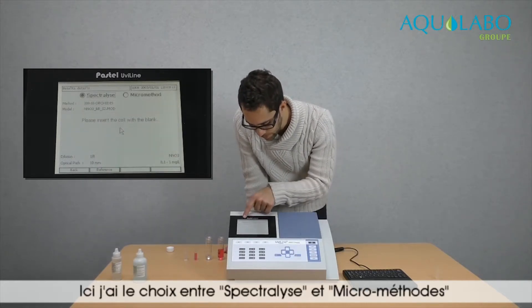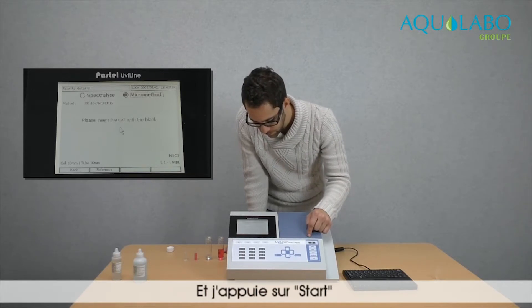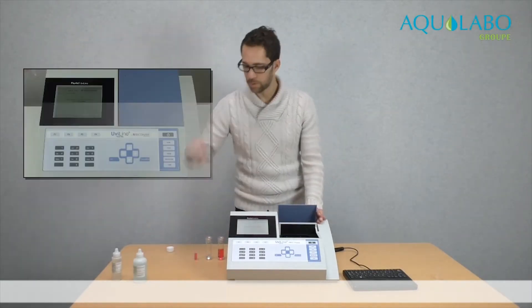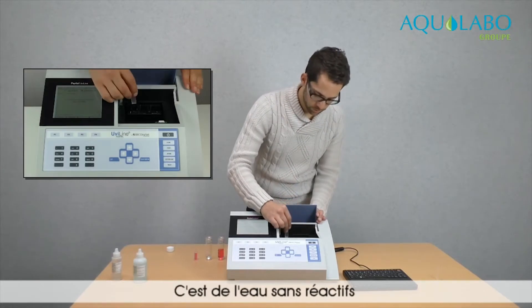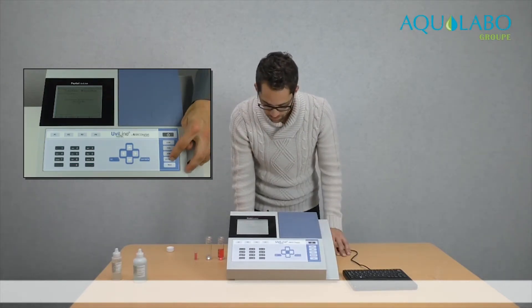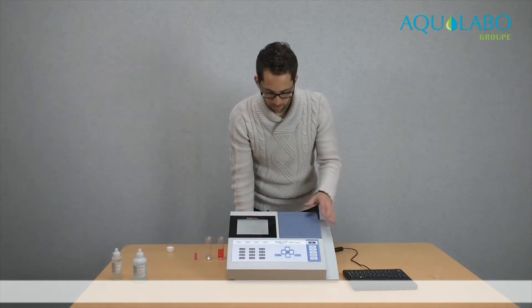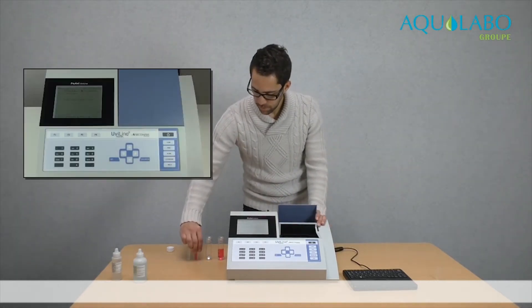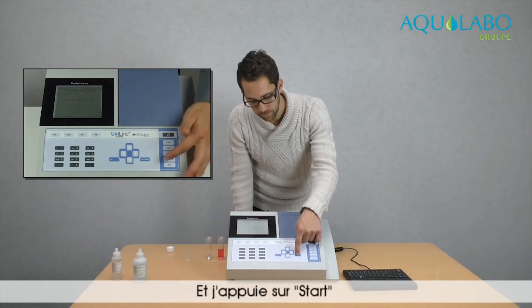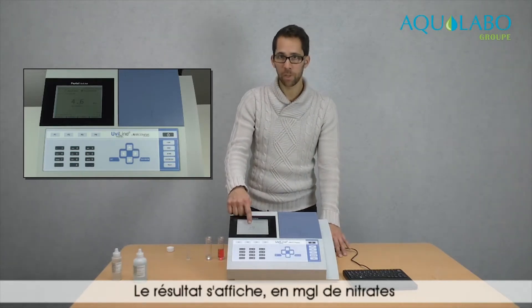Here I have the choice between spectralized and micromethod. So I choose micromethod and I press start. Now I have to put a blank sample — water without reagent — and then I press zero. I remove the cell, and then I put the sample with reagents, and I press start. And here is the result in milligrams per liter of nitrates.